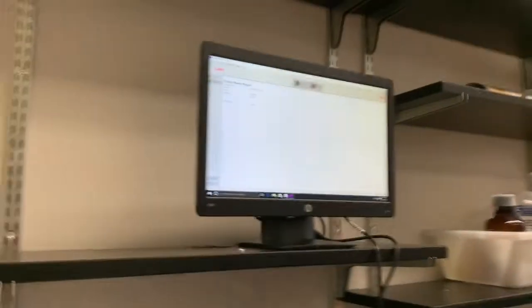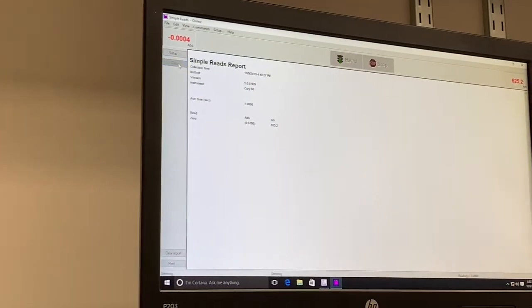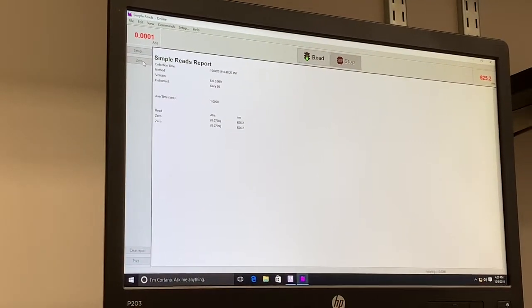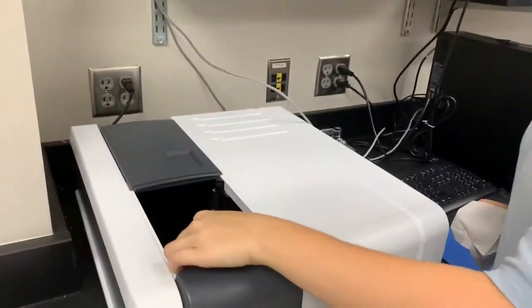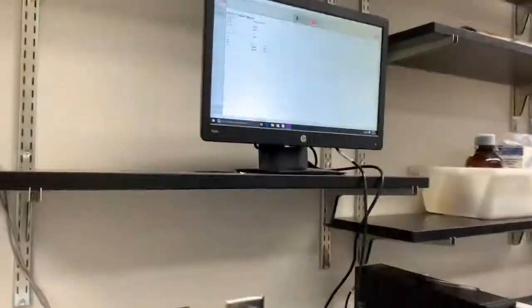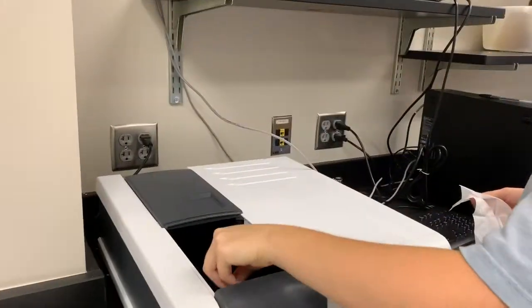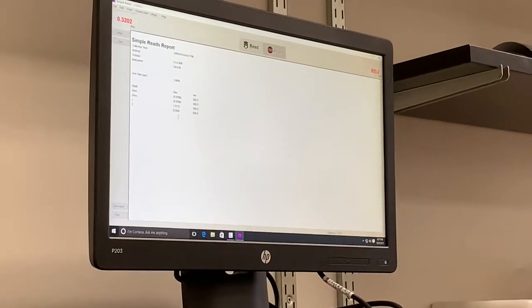After we scanned the stock to find the lambda max, we zeroed out the program using the blank cuvette, getting as close to zero absorbance as possible to subtract out absorbance due to other species in the solution. Then we measured the absorbance of each of the dilutions, recording them as we went, making sure to wipe them before putting them back in the spectrometer and closing it back.